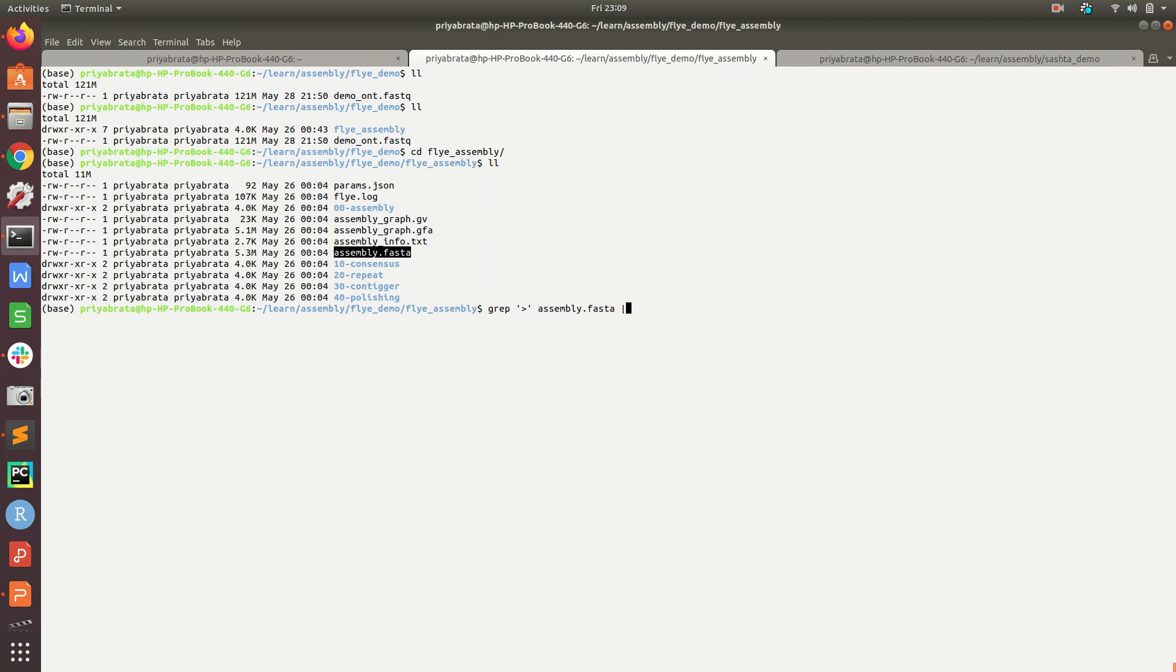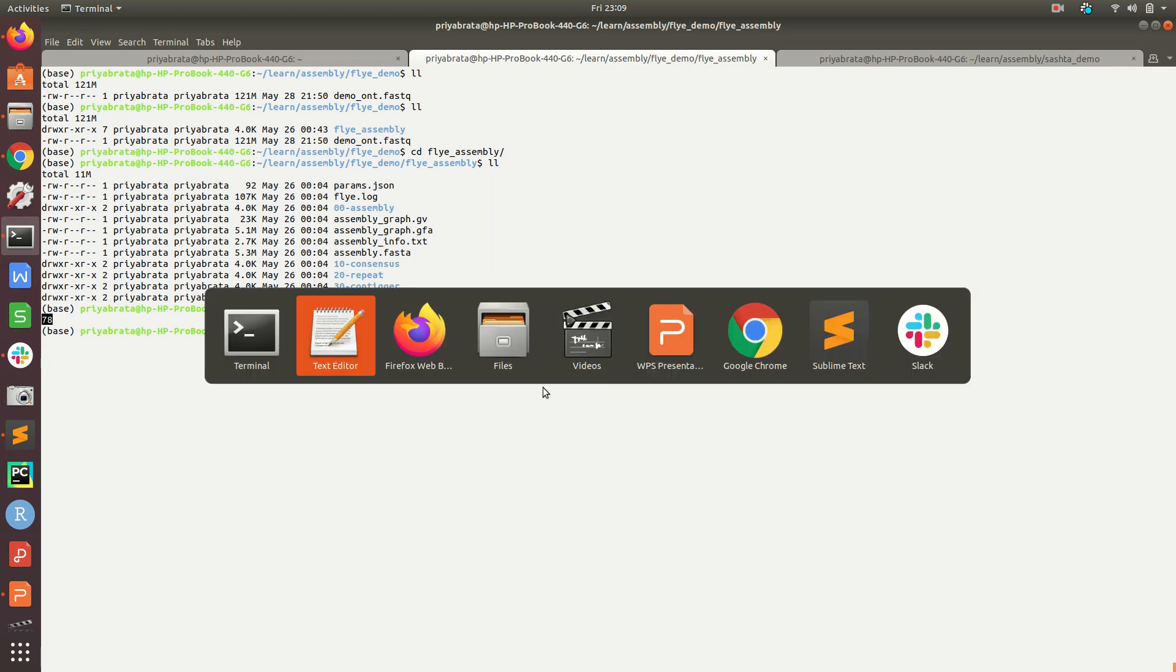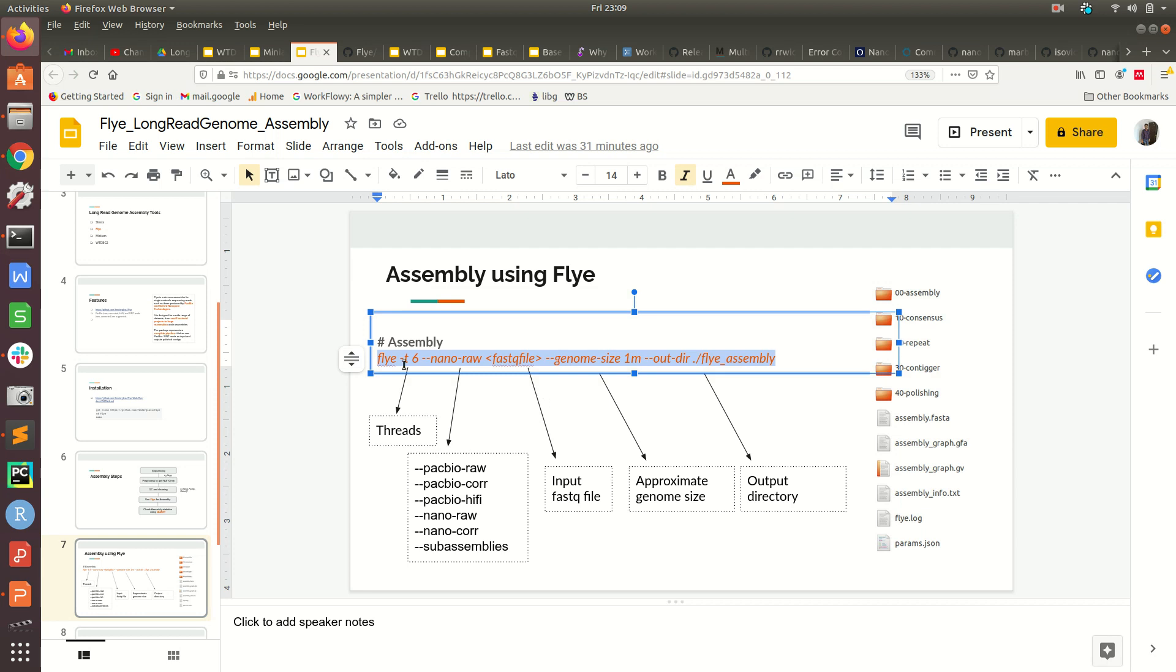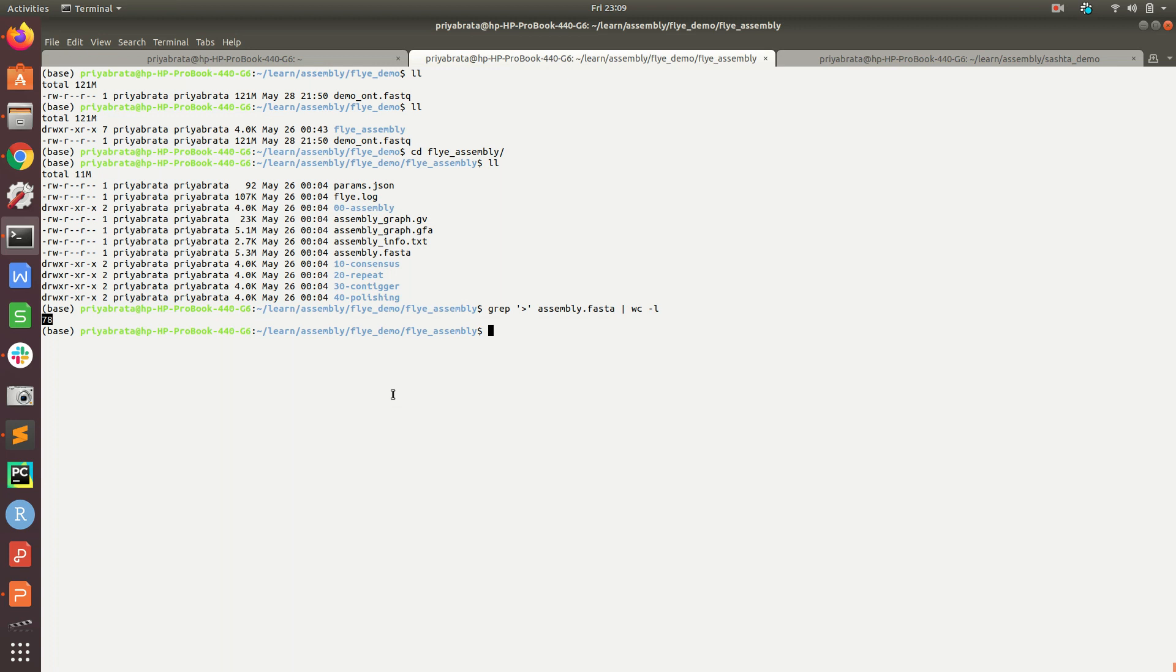We can check how many contigs are there by simply using grep and wc -l. Now you see there are 78 contigs. Flye assembled this into 78 contigs. We applied this to the Nanopore FASTQ file and now the FASTA file is available in the flye_assembly folder.